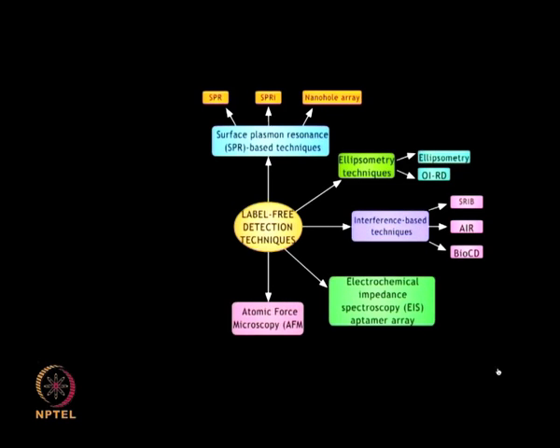Atomic force microscopy, AFM. The vertical or horizontal deflections of a cantilever are measured by a high resolution scanning probe microscope, thereby providing significant information about surface features.